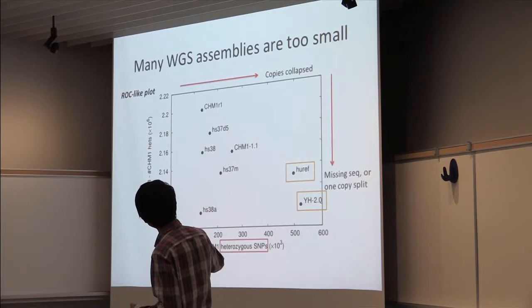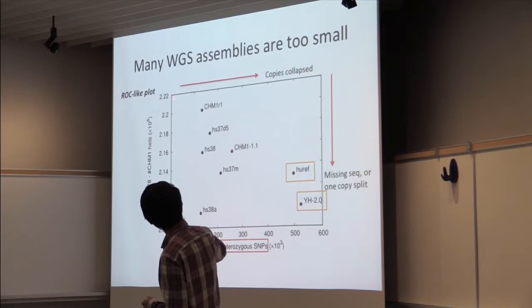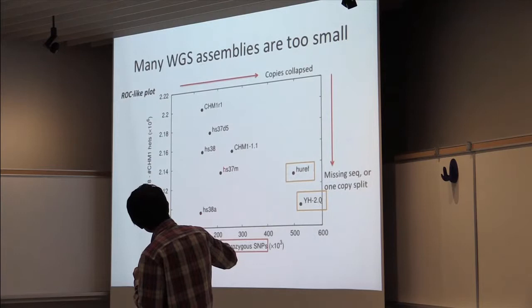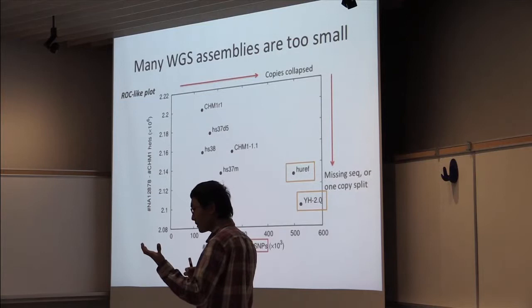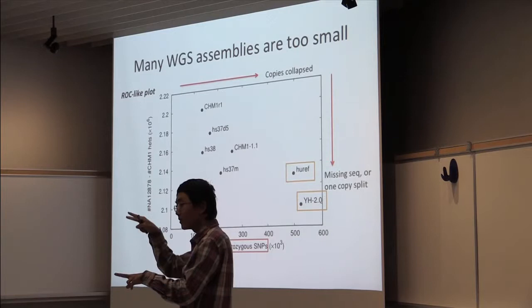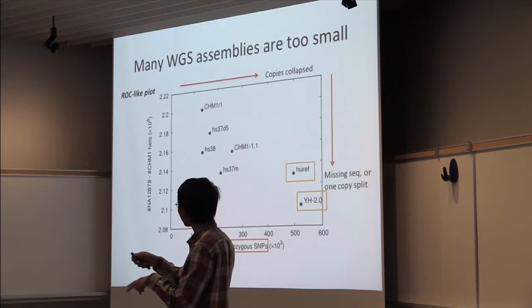The reason we see it down here is that, say, we take this, this is GRCh37, the reference genome. The reason we see it down here is because the reference genome is not really complete. Say there are two copies in CHM1, but in the assembly, because the divergence is not high, they merge into one copy. And so the two copies from CHM1 will be mapped to the same position. And the difference between the copies will become heterozygotes. That's why you see heterozygotes here.